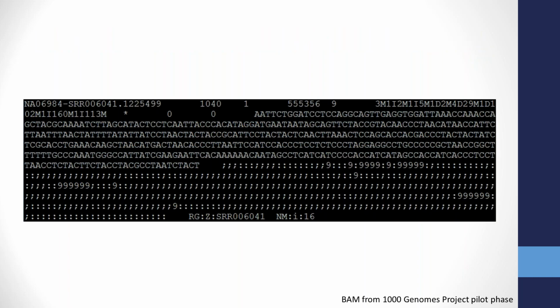And to break it down, here's an example of one record in a BAM file. So it kind of looks overwhelming, but if you break it down piece by piece, it's not too bad. So we've got the read name. The next part of that is going to be that bitwise flag. This is basically telling me that this read is oriented on the opposite strand and that it was filtered out for some reason. Got the chromosome, the position on that chromosome, the mapping quality, so pretty low mapping quality for this one. This is that CIGAR, that representation of matches and mismatches.